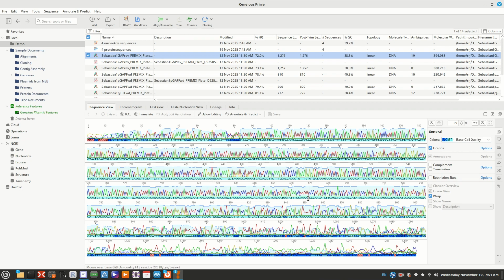You don't have to, but as a general rule, you would. You could leave it in as a space holder for that nucleotide to help with alignment, but if most of your alignment is coming from the sequence in the middle, the ends don't matter, which ours probably don't. We just care about the middle part, so trimming it is just fine.